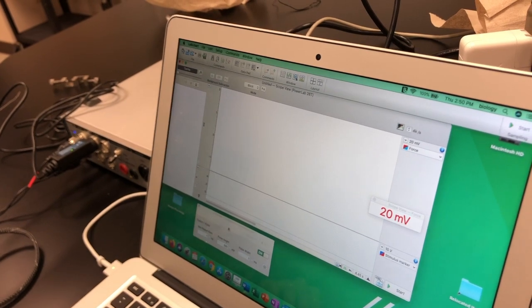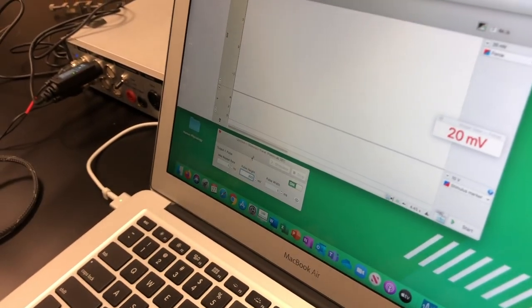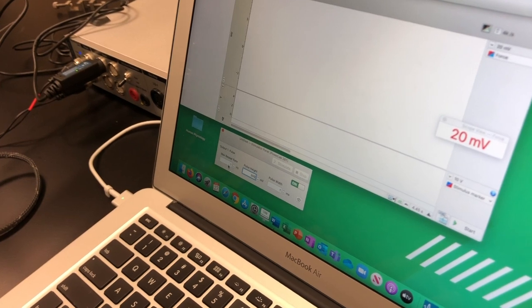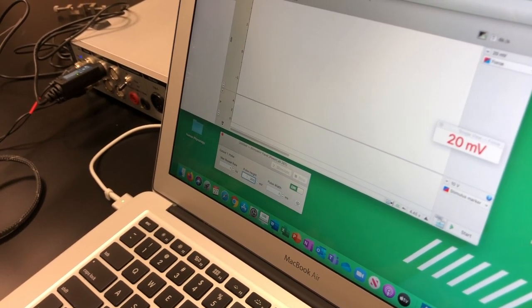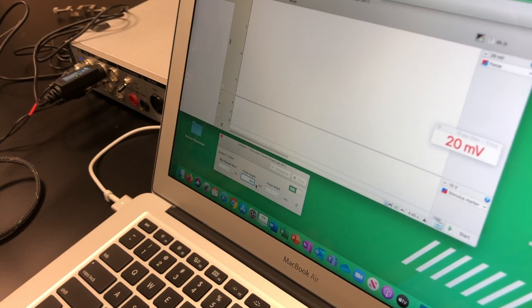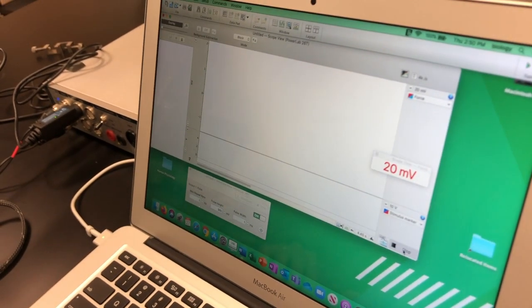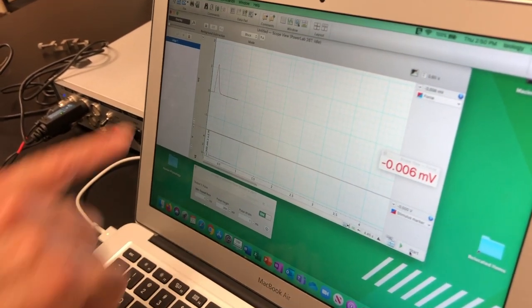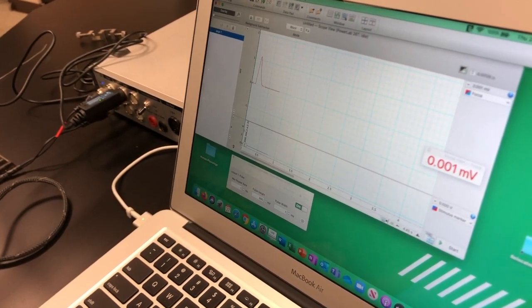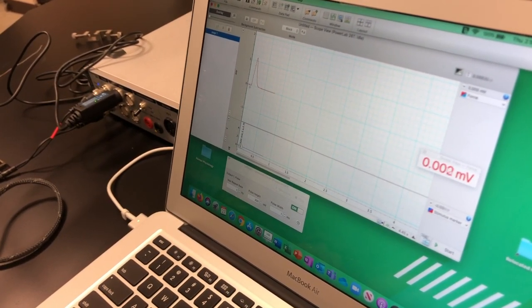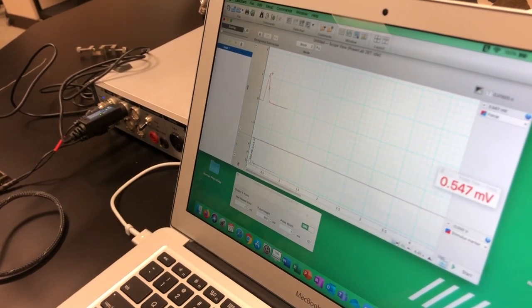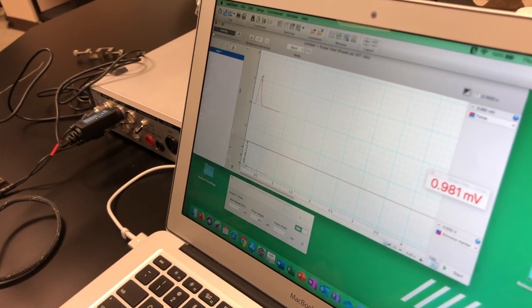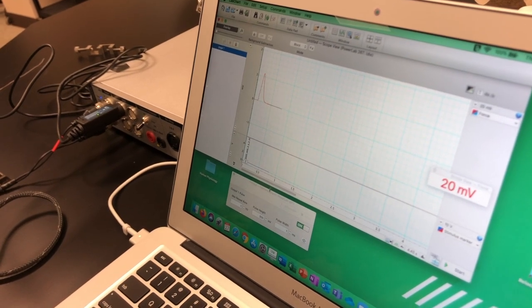And now you're going to have your stimulator panel open. We're going to start with just doing a frequency of one hertz and then we're going to stimulate with 300 millivolts. So let's see what happens. You can see a nice little peak there. So stimulus is recorded down here. This is the millivolts, which roughly translate into newtons by the force transducer.